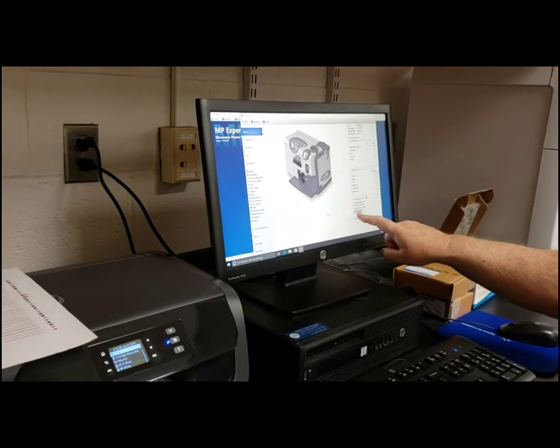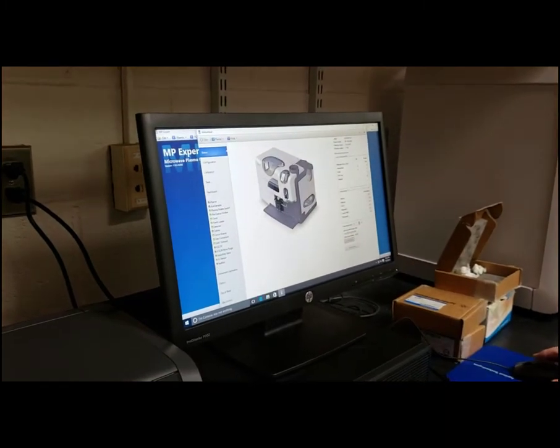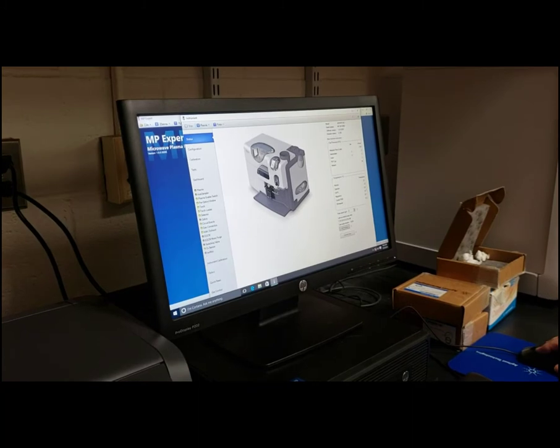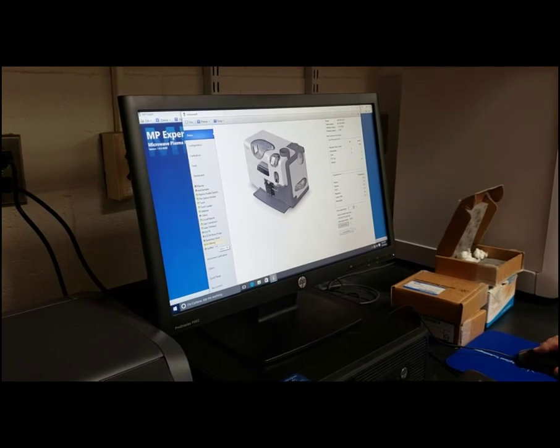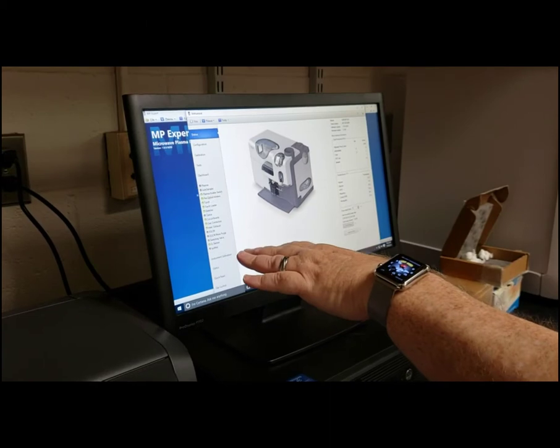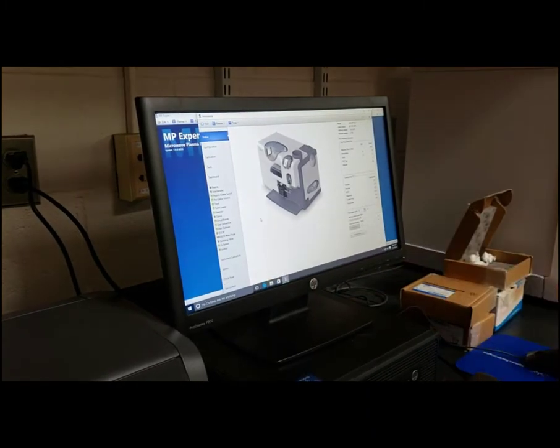If this is something that is active, you click it, and then that turns green, that this area is fine, there's no problem. If this is grayed out, that means there's no issue with the O2 sensor and everything should be fine. All right. So now that we've established everything right now is in green zone, some things haven't established themselves yet, but we don't want to see anything yellow.